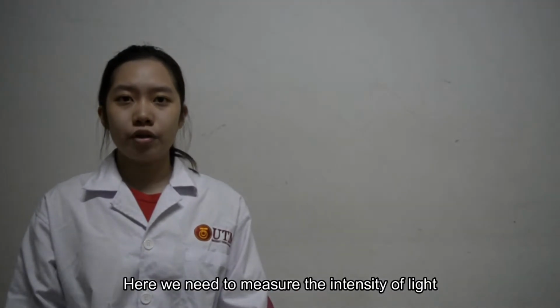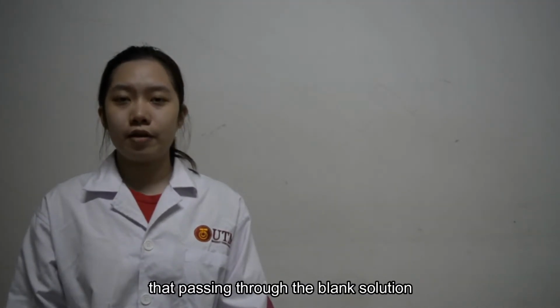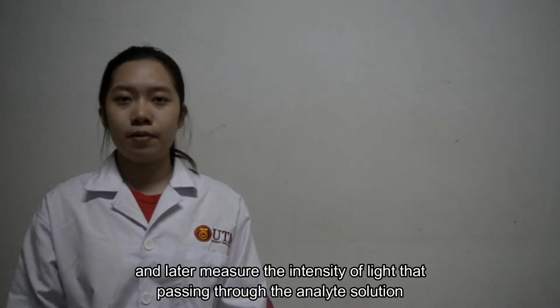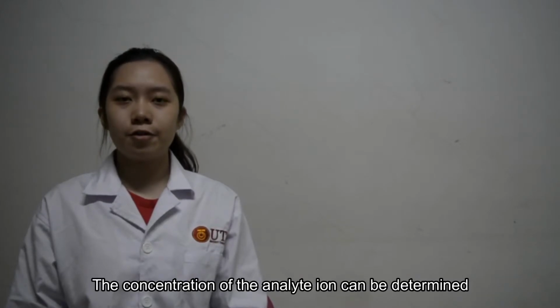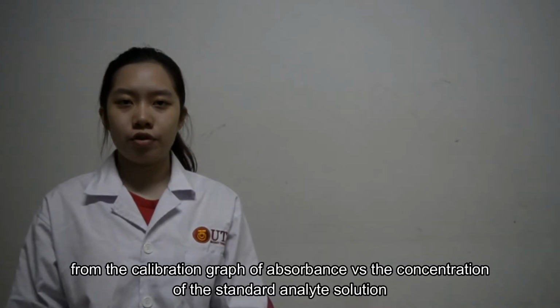Here we need to measure the intensity of light passing through the blank solution and later measure the intensity of light passing through the analyte solution. Then calculate the absorbance. The concentrations of the analyte ions can be determined from the calibration graph of absorbance versus the concentrations of the standard analyte solutions.